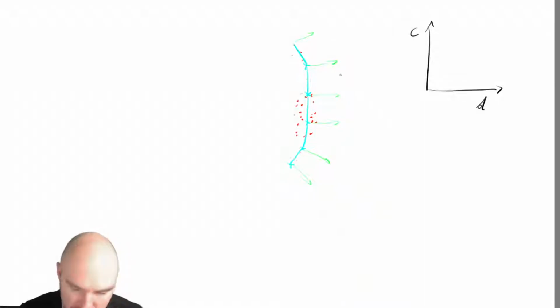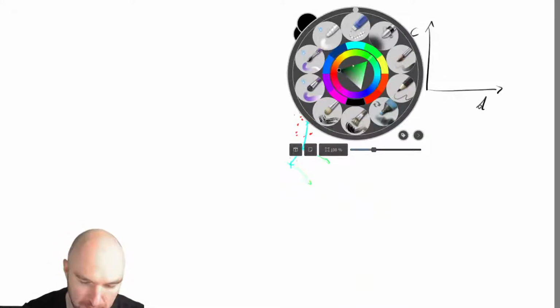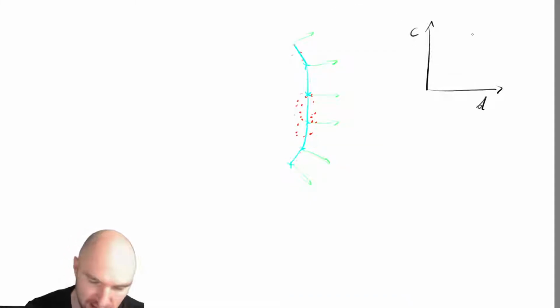The way that works is actually the way that the proxigram that we looked at has always worked, and maybe I haven't shown that all that clearly: when we're doing a distance calculation, we allocate each atom to the closest vertex anyway, because we need to work along this surface normal, so we know which vertex each atom is closest to.